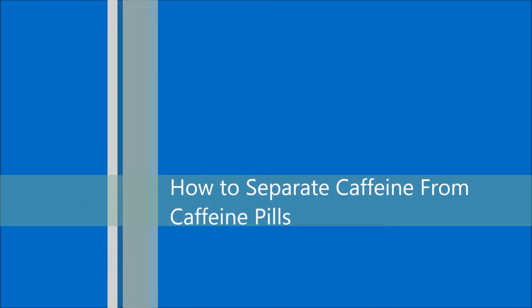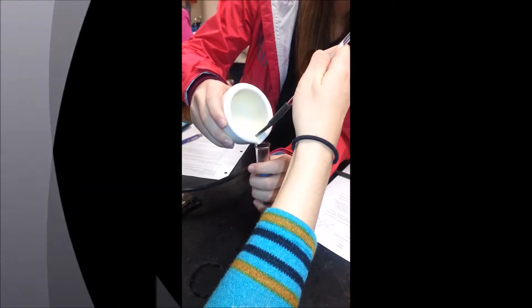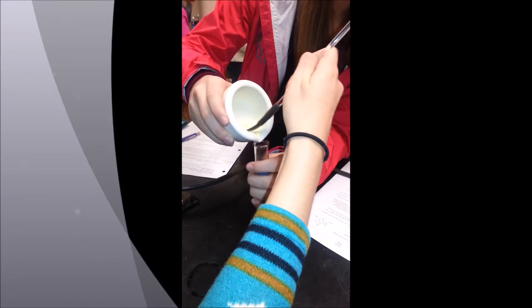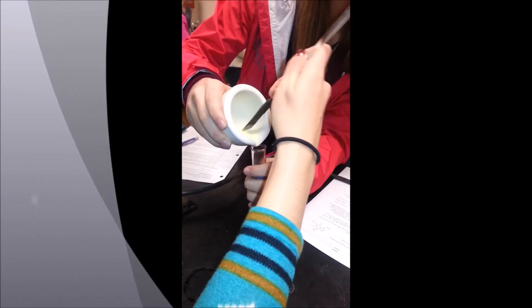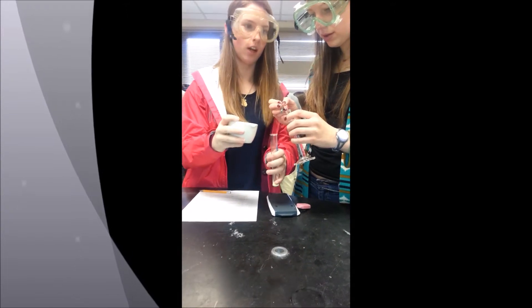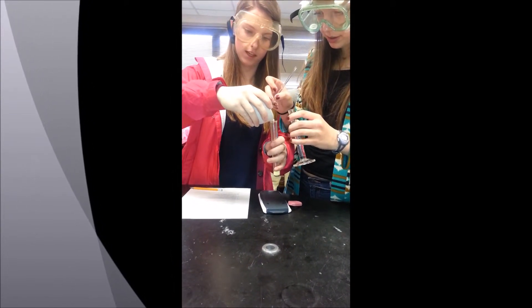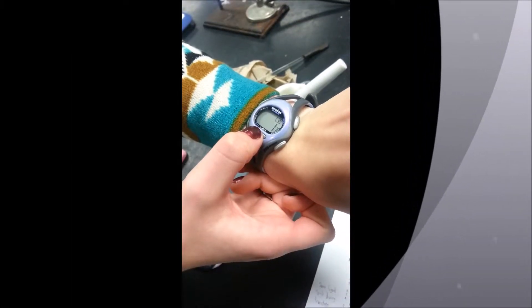How to separate caffeine from caffeine pills: Use a mortar and pestle to grind the caffeine pills into a fine powder. Using a rubber policeman, transfer your powder into a test tube, adding 10 milliliters of water.